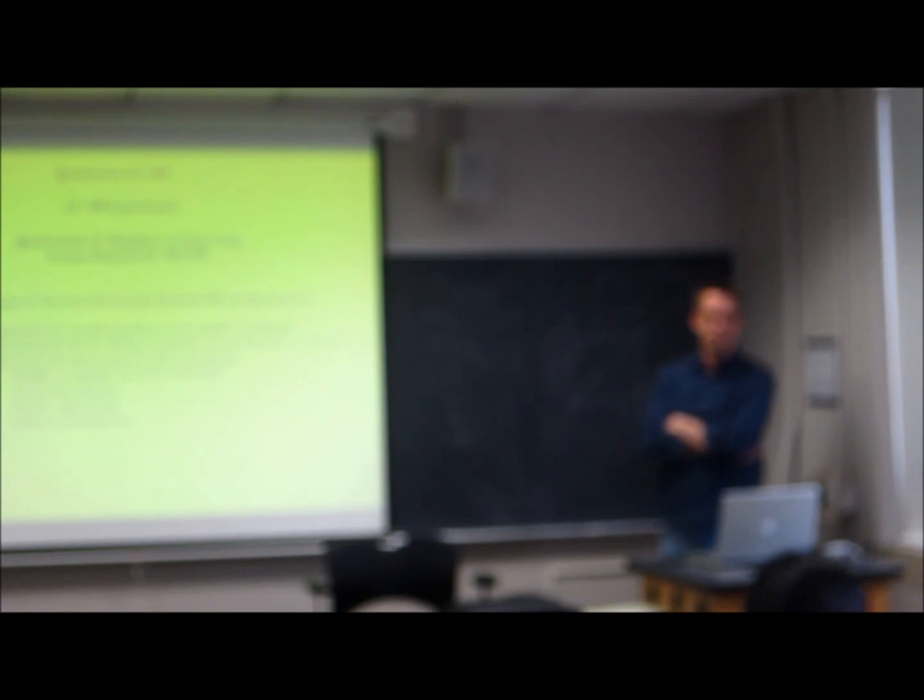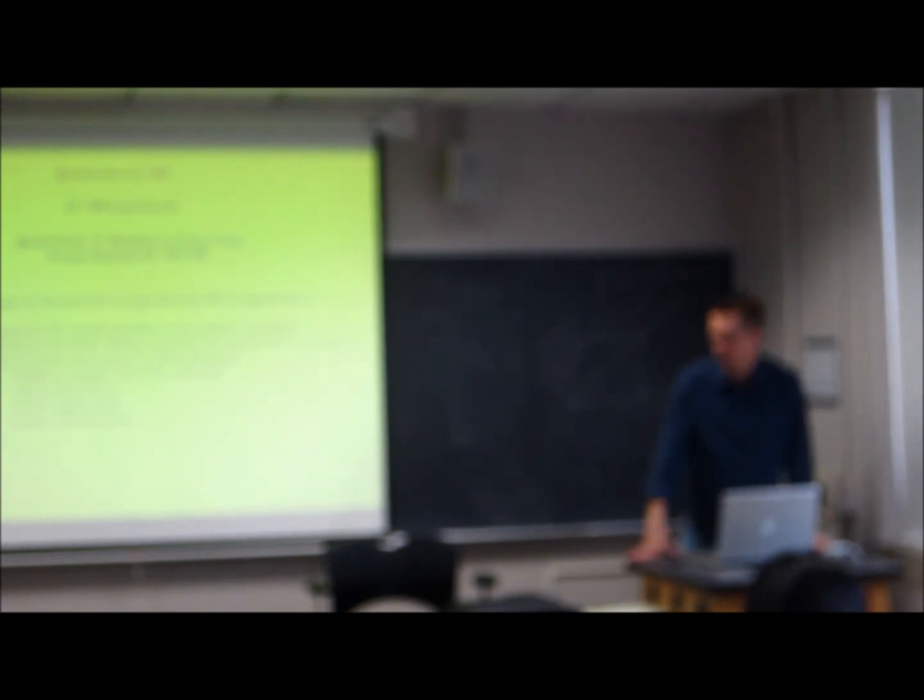Yeah. Using calibration, what do you do in limit of detection and quantitation? Oh, good question. Different people do it different ways. Typically, limit of detection is determined by 3 times the signal to noise.